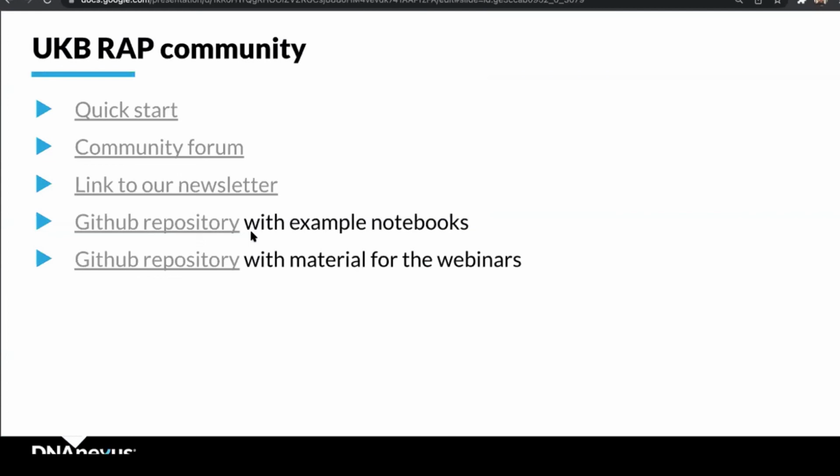Yeah. So I just want to point out from the answered questions that we have, there was a question about whether one can also annotate LMM output. And yes, as our colleague Andre answered, it's about the file format. Your file should be tab separated, there should be a header in the beginning, and you should have p-value, either log transformed or not transformed, chromosome and position, and some identifier of your variant to figure out variant annotation and to annotate it.